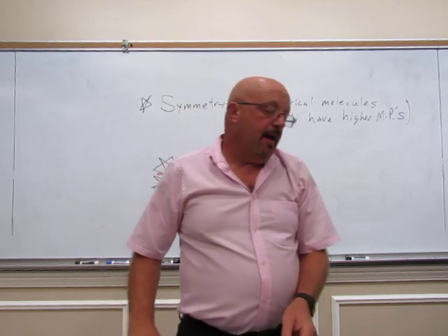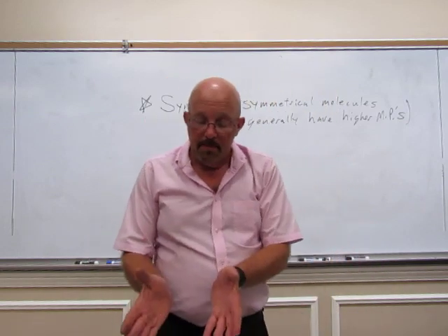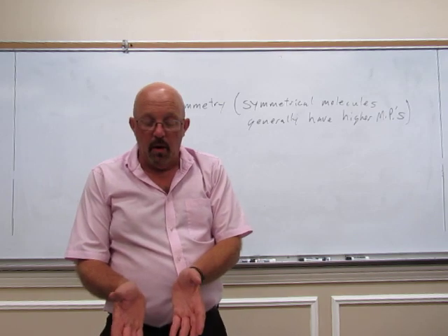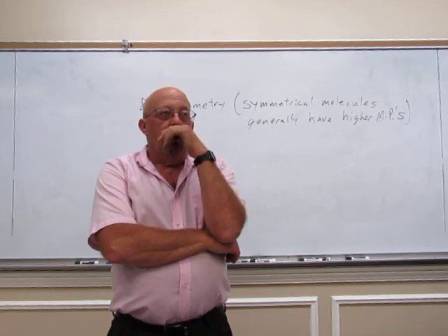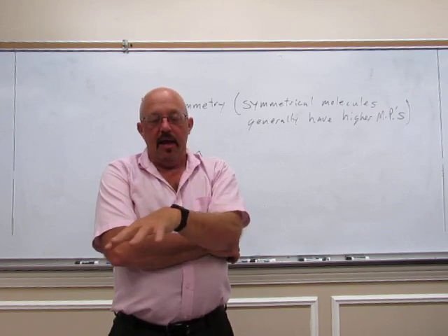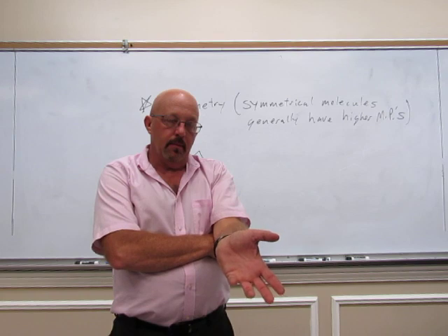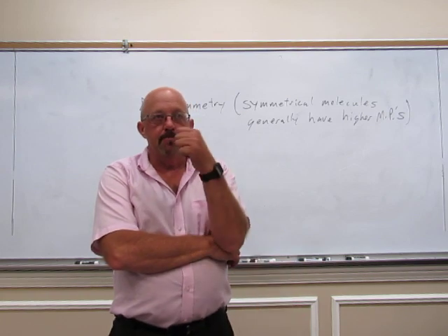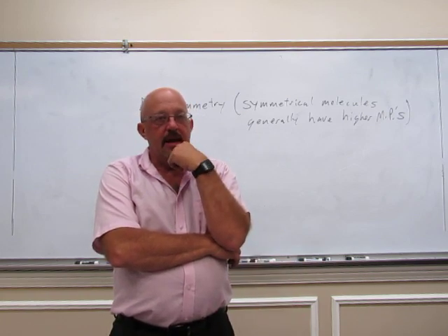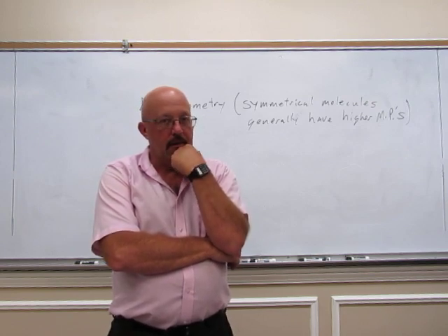Now, we need to get a melting point of the samples. The problem is we're recrystallizing with water and ethanol. Water takes a long time to dry. And any of the solvent that's still on the crystals will act as an impurity. So that would lower a melting point. They really need at least a day or two to dry fully, to be completely dry.